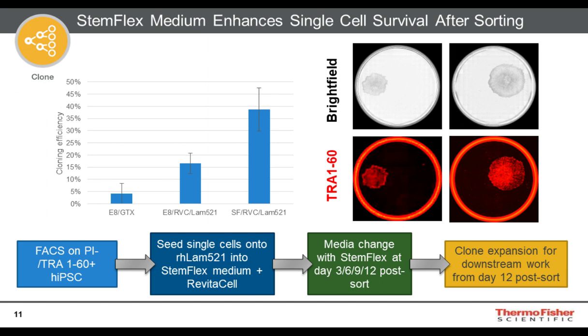So really, by using the FACS system, we were able to bring down the clonal isolation from a several-month process, with having to isolate manual clones several times to get to your clonal line, to a process that takes about 2 weeks, which is a dramatic improvement.